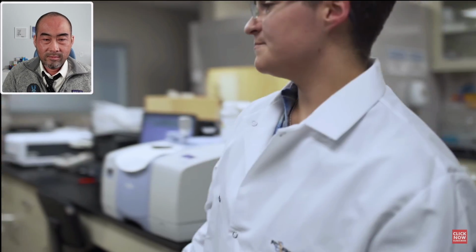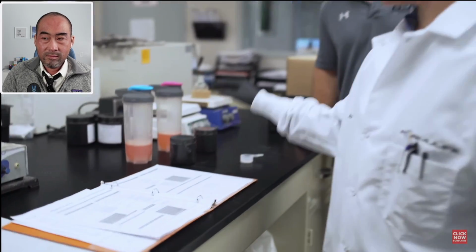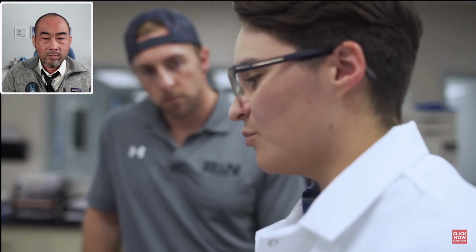After it's being blended, it's called in-process sampling, and they'll bring us an in-process sample. So this actually happens before it even gets bottled with a label, finished product, ready to ship and sell. We do pH testing, organoleptic, make sure it looks the same, tastes the same by our R&D department, as well as we give it an FTIR fingerprint. It's not necessarily an ID, but it gives us a good picture of continuity for every batch that you do, just to make sure that fingerprint stays the same.